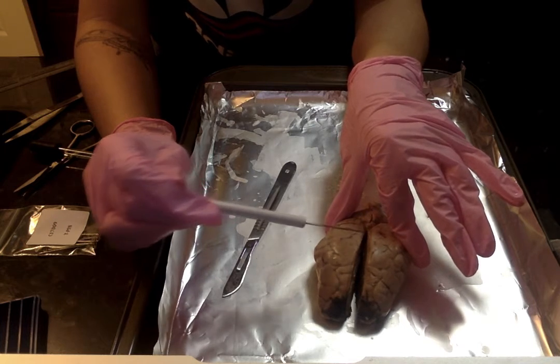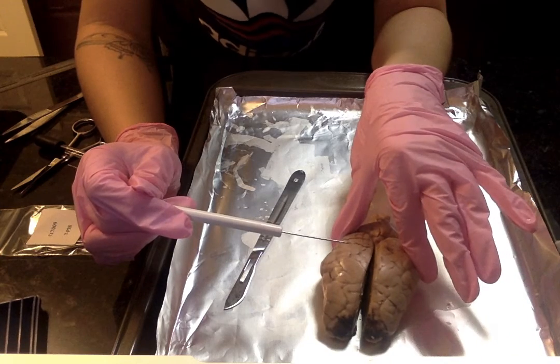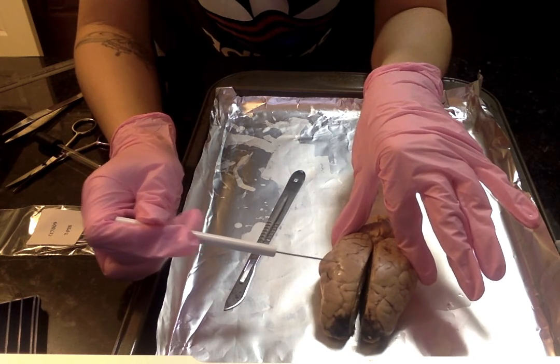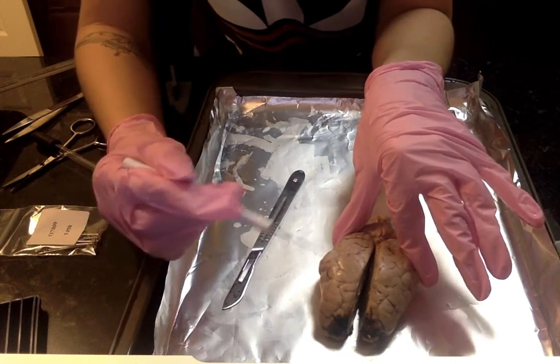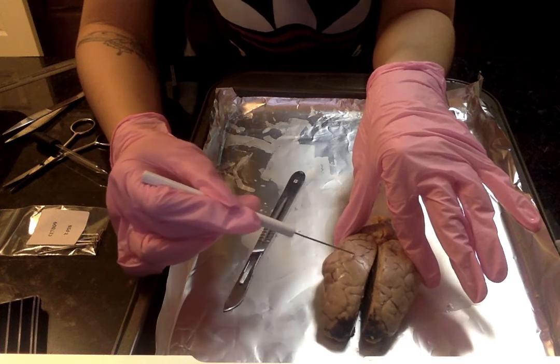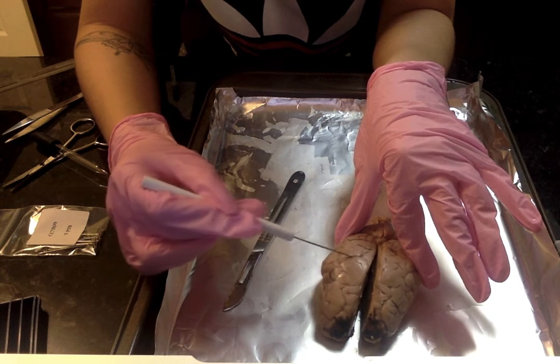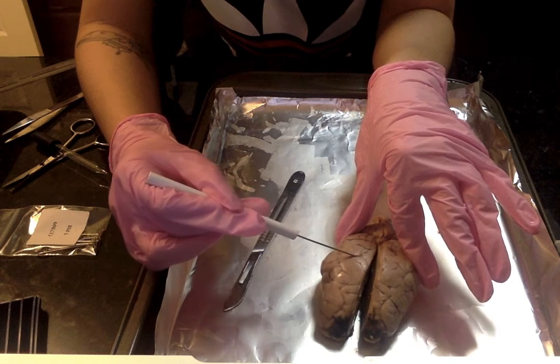And also I wanted to try to identify the sulci and the gyri. I don't know if I'm saying that right. I believe that the sulci would be the lines, the folds, and the gyri would be in between all the sulci.